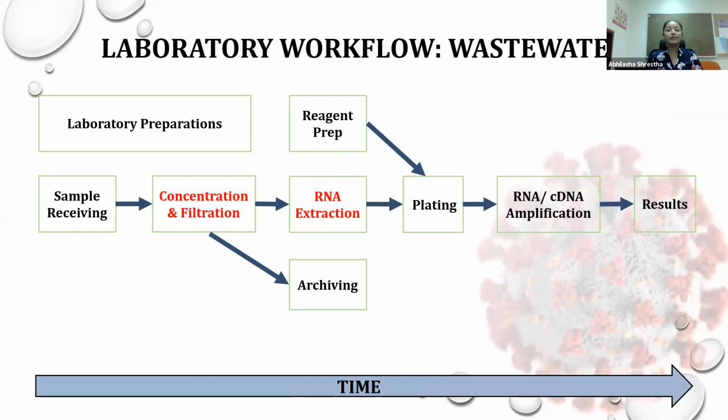And now here is a setup that we adapted for the wastewater processing. Again, we made sure that there were separate dirty and clean work areas in order to reduce contamination. I will explain each of these steps briefly in my next slide. But the main difference here was that for wastewater, we needed to concentrate the virus and then also do a clean extraction using a kit. We couldn't do a crude extraction like we would for the beach water.